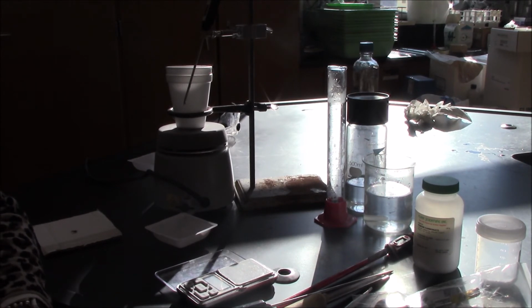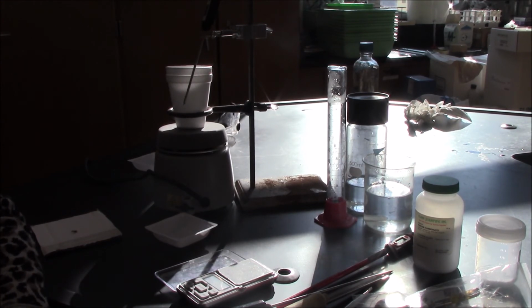So in this part I'm going to measure an initial volume of 50 milliliters of water and an initial temperature for that volume of water. I am then going to measure out 5 grams of each solid, because 5 grams should give me a sufficient temperature change so that my data is considered reasonable and reliable.